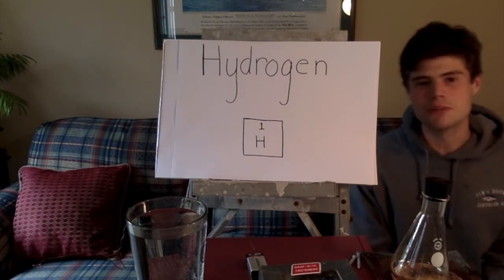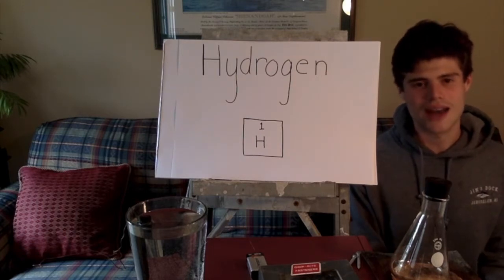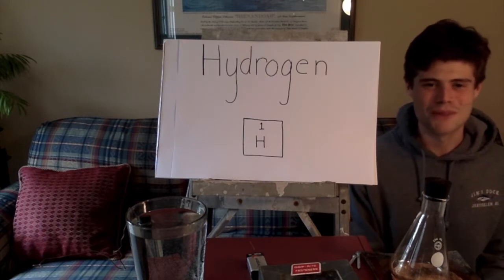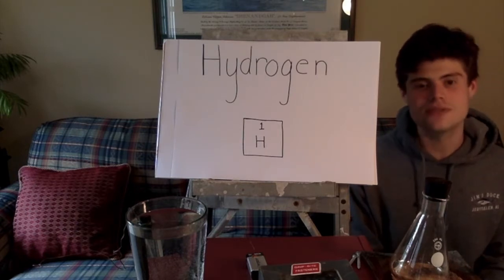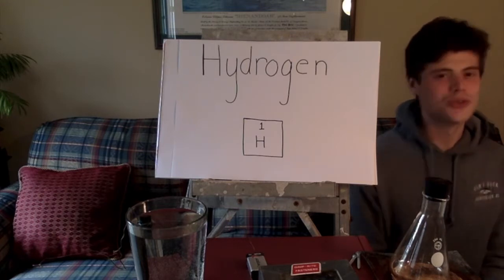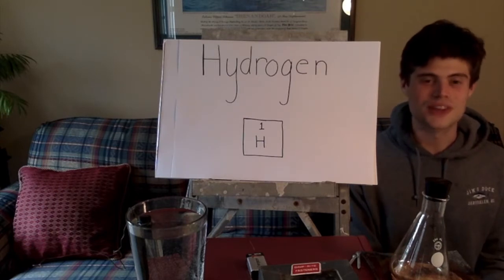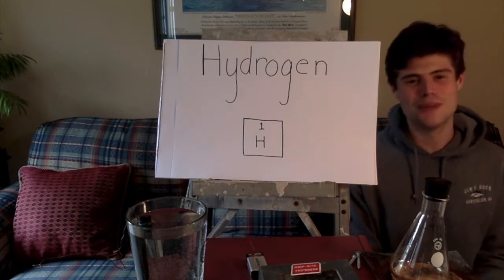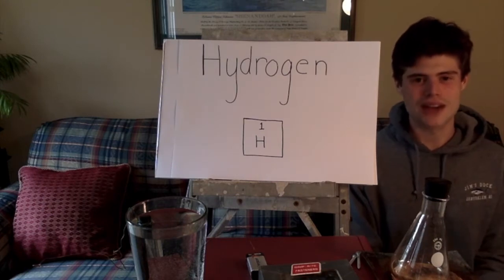The first, we're going to pull hydrogen out of hydrochloric acid, or people call it muriatic acid. I'm going to start with this experiment because it's a little bit more exciting, it's a little bit more fun. Hydrogen is incredibly flammable. It's one of the most reactive elements in our universe. And that means that if I introduce it to a high energy flame, it's going to combust very quickly. If you've ever heard of a hydrogen bomb, you'll maybe understand how devastating these kinds of reactions can be.